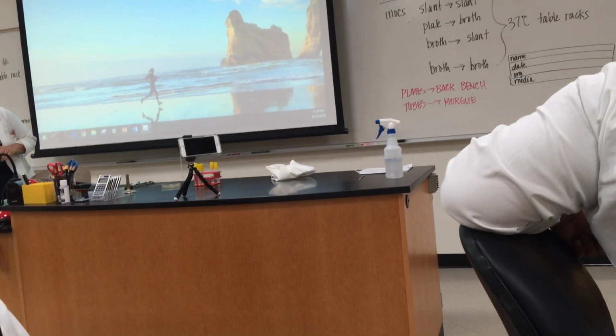I should say, non-hazardous materials, so paper towels that you use to clean the countertops or to wipe your hands, go in the trash. They don't go in the morgue, right? Because those are not contaminated materials. All right, so that is that. That's all of our little lab prep stuff.